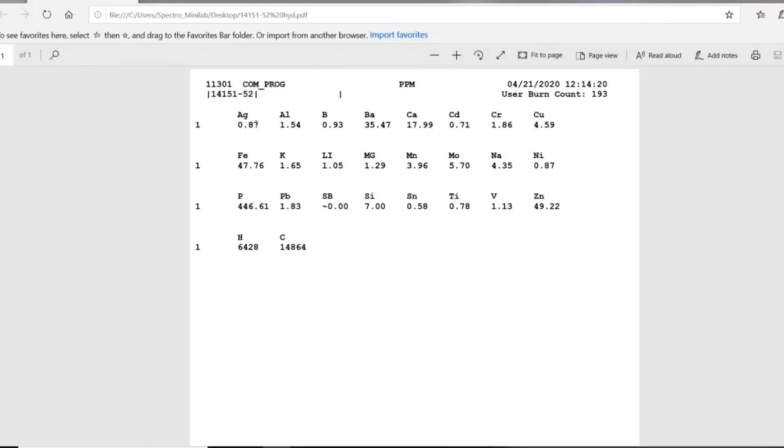So it's really just a set of numbers that go together hand in glove with the other numbers, and it gives the system the ability to offer a diagnosis. So it's looking at a more holistic approach to the whole aspect of condition monitoring by oil analysis.